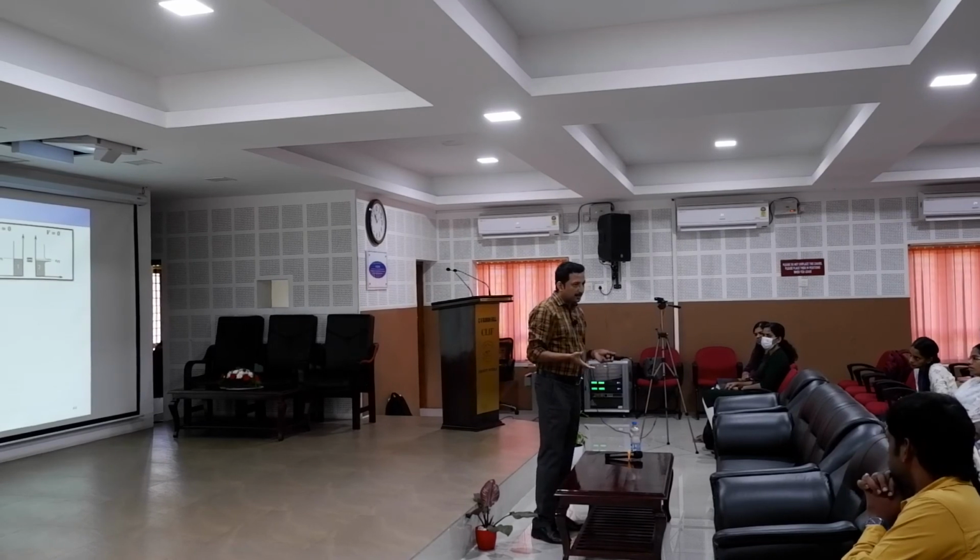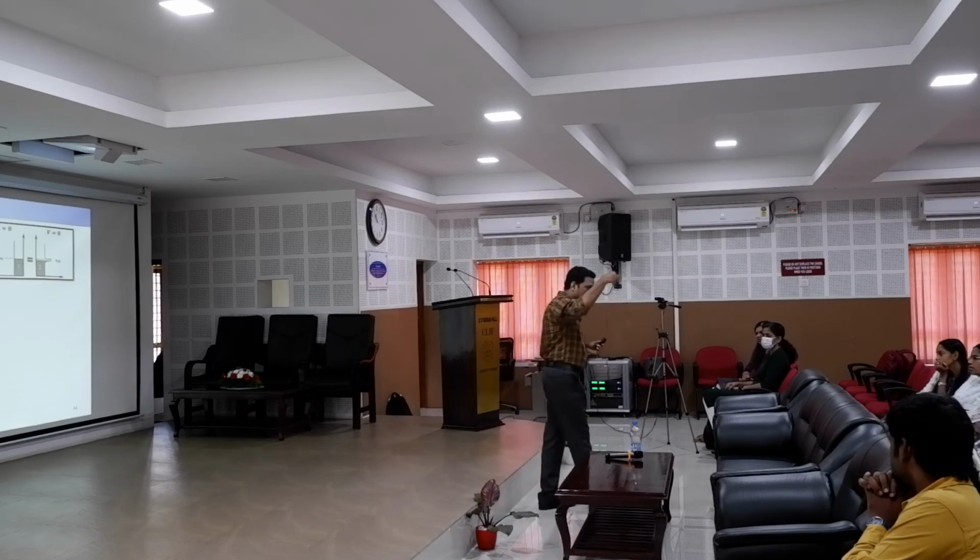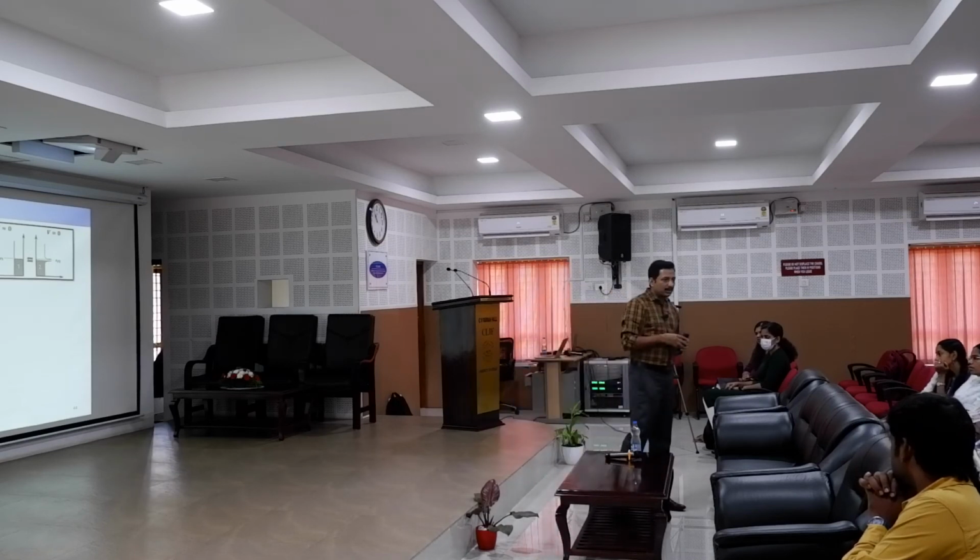And conduction band means what? Let's say excited state. So that's an important thing. If I am imaging a molecule with the tip negative and the molecule positive, which means that I am supplying electrons to the molecule, it will go to the conduction band of the molecule. Whatever image I am going to get is the conduction band, the excited state of the molecule.